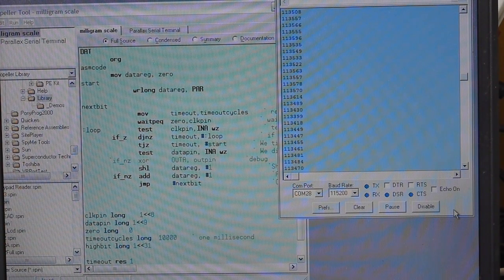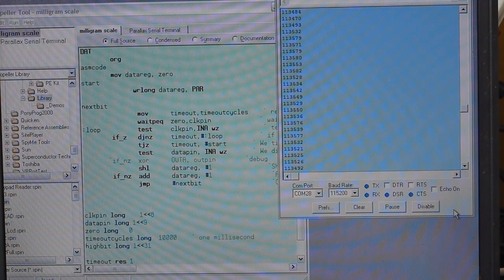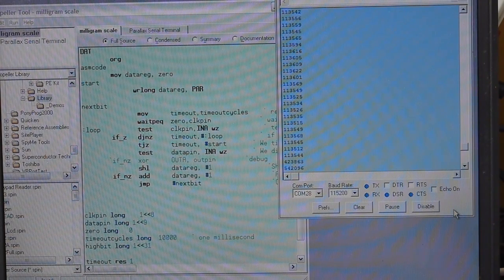I'm definitely not an experienced assembly coder, so I was just happy to get this working - it could be optimized, but there's plenty of time at 80 MHz with four clocks per instruction. I have a loop that times out after one millisecond. When it times out it resets its 32-bit register, then as bits come in from the ADC it fills up that register. When it times out again it sends the value back to the main program loop and resets. This takes advantage of the fact that data comes in bursts - a long timeout signals the start of incoming data. Pressing on the scale shows the debug value going up. Pressing the tare button on the front doesn't change this value, so unit conversion and tare functions are all done downstream in the microcontroller.